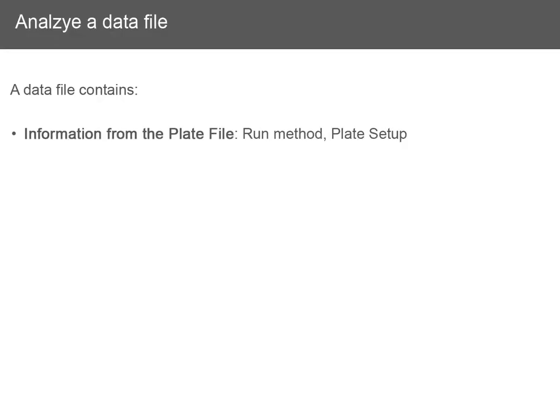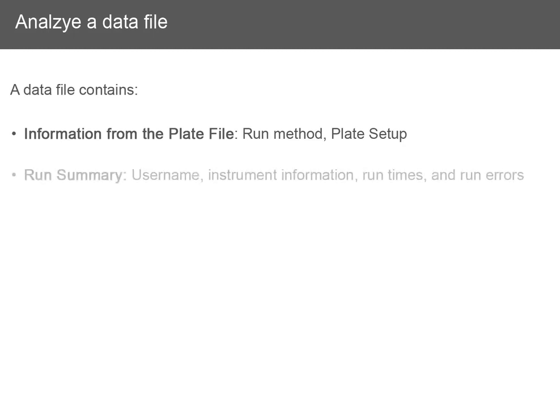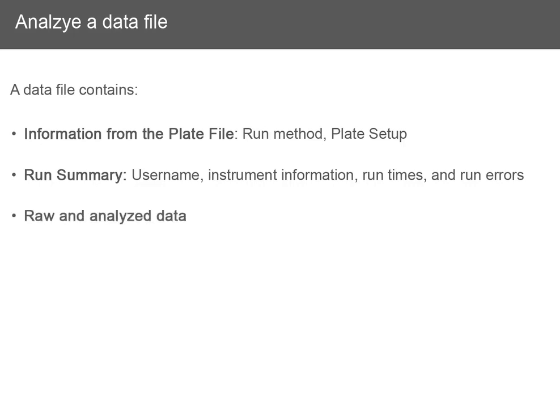A data file contains information from the plate file, including the run method and plate setup, the run summary including the user name, instrument information, run times and run errors, and the raw and analyzed data.